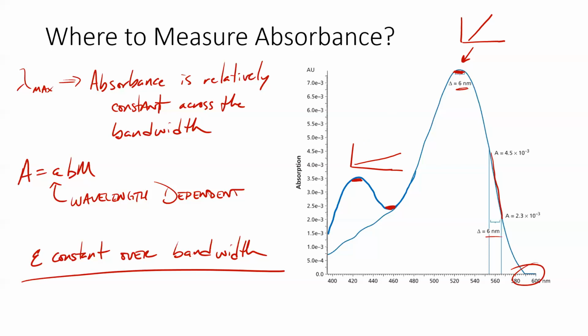Epsilon is smaller, so we actually get a longer linear range when we measure at a smaller peak. And it all depends on what kind of experiment we're interested in, right? If we're interested in measuring a very wide range of concentrations, maybe we should choose not the highest peak. But more often than not, we want to know a concentration very accurately. In order to know a concentration more accurately, we need a bigger delta between those concentrations, and that's easier to get when our epsilon is larger.